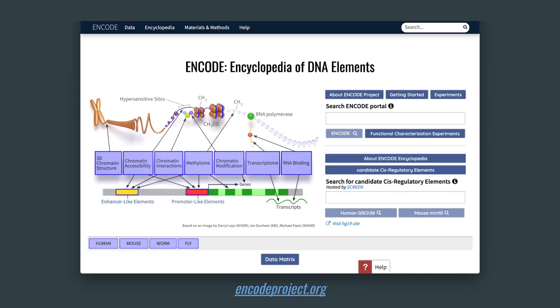Here you see the home page for the ENCODE Portal, which you can access using the URL encodeproject.org. The remaining modules in this section will teach you more about the portal and how to explore these resources.